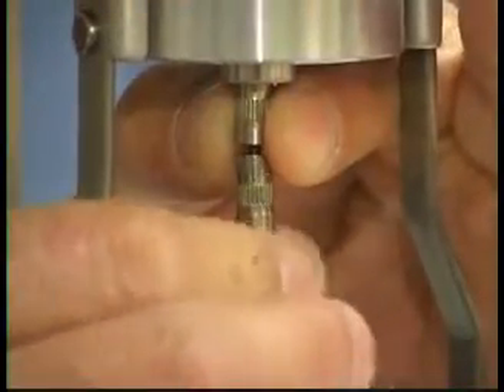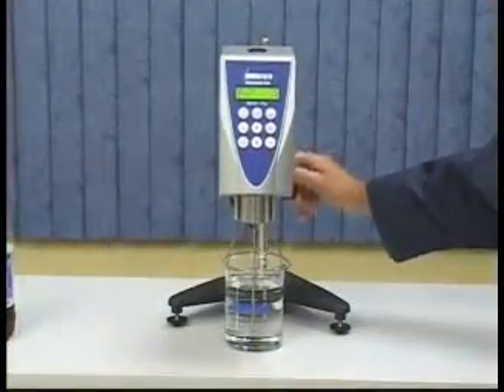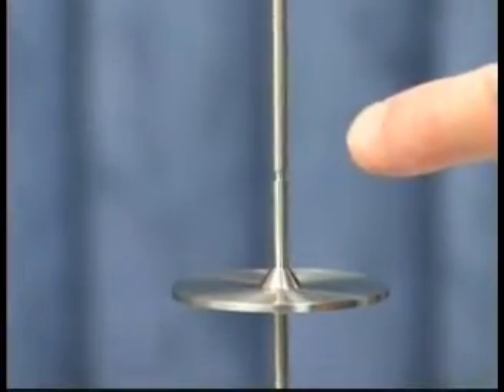As you attach the spindle, keep in mind that it has a left-handed thread. Turn the gear knob to move the instrument up and down until the fluid is level with the spindle's immersion groove.